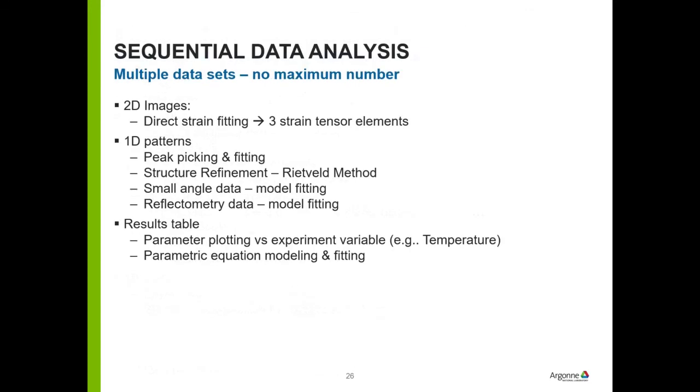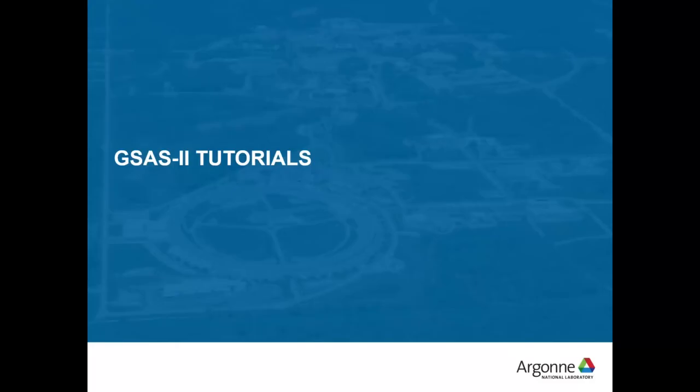Multiple data sets. This simply picks out all the things that you can do with sequential fitting, to track something as a function of temperature, or pressure, or loading, or what have you.